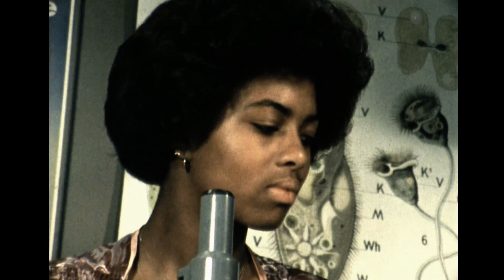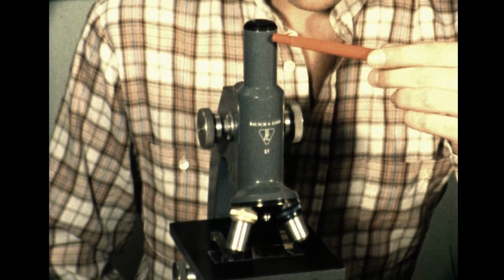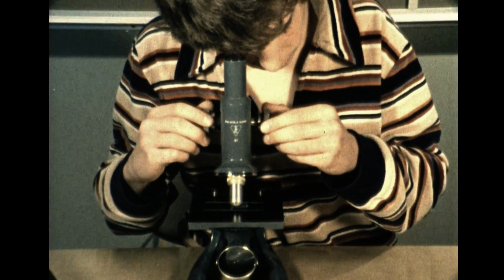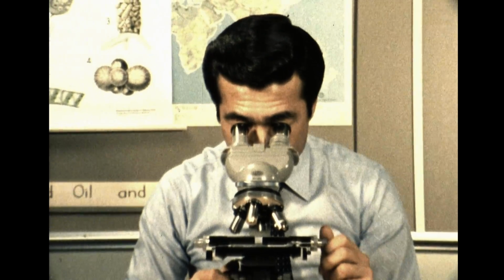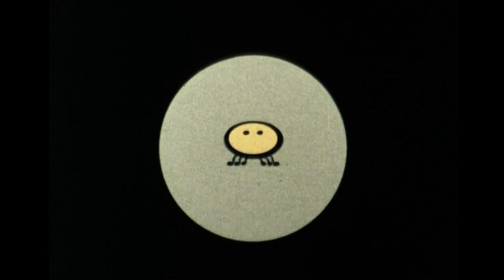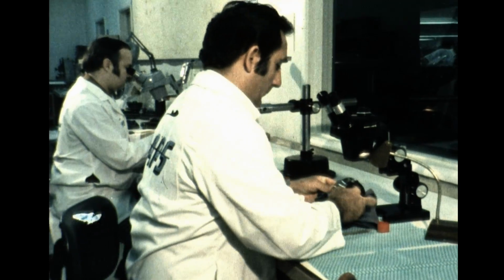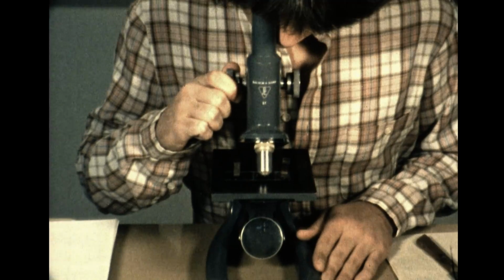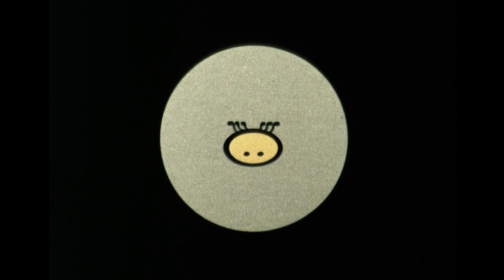The magnification is produced by lens systems, the eyepiece or ocular. It's the upper lens. Instruments with one eyepiece are called monocular microscopes. Those with two eyepieces are often referred to as binocular microscopes. The latter shows the image in real position, important for some industrial assemblies. The monocular microscope, on the other hand, reverses and inverts the image.